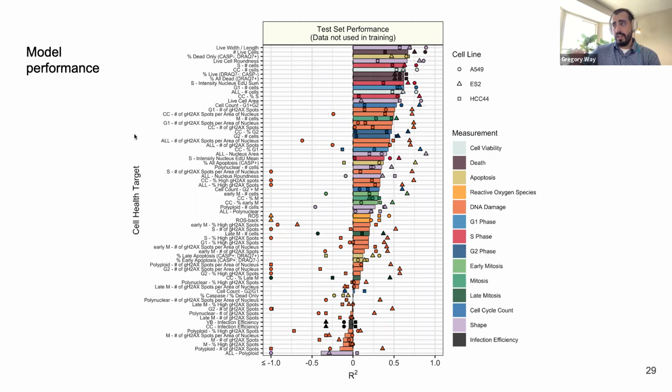One limitation in this study was that we had only 119 guides by 3 cell lines. That's 357 different perturbations that we were training our models on. That's a really small data set to try to fit a machine learning model. In the paper, we have a figure where we slowly remove samples and show that by no means have we plateaued in our performance, which indicates that if we increase the amount of data, we're likely to also see an increase in model performance.